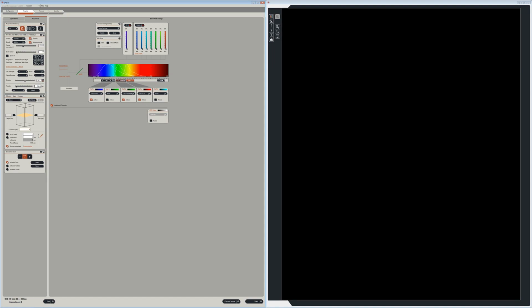But if you look here, these two curves overlap. So what I would like to do is have 3 different scans, each of them scanning one of the fluorophores at a time. So if I come back here to scan, I'm going to add 2 more scans, and once you add them, what it does is that it duplicates whatever you had in the initial scan. So now I'm going to go back to my scan 1, and I'm going to remove these 2, and I'm going to turn on the laser for this, and let's say I'm going to leave it at 38%.